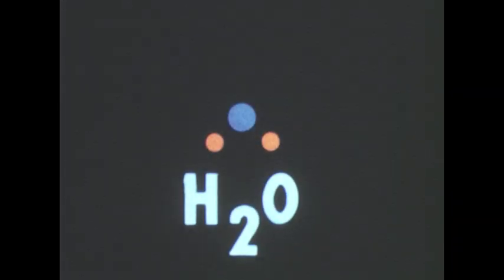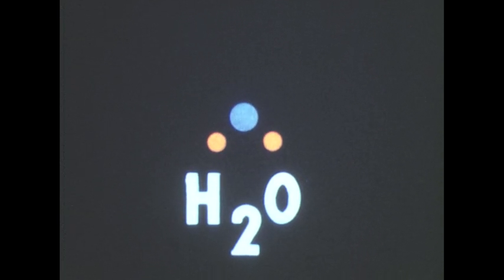In the case of a nonlinear molecule, such as H2O, there are 3n-6, or three fundamental vibrations: the symmetrical stretching vibration, the unsymmetrical stretching vibration, and the bending vibration. All these vibrations are infrared active and produce three infrared absorption bands.